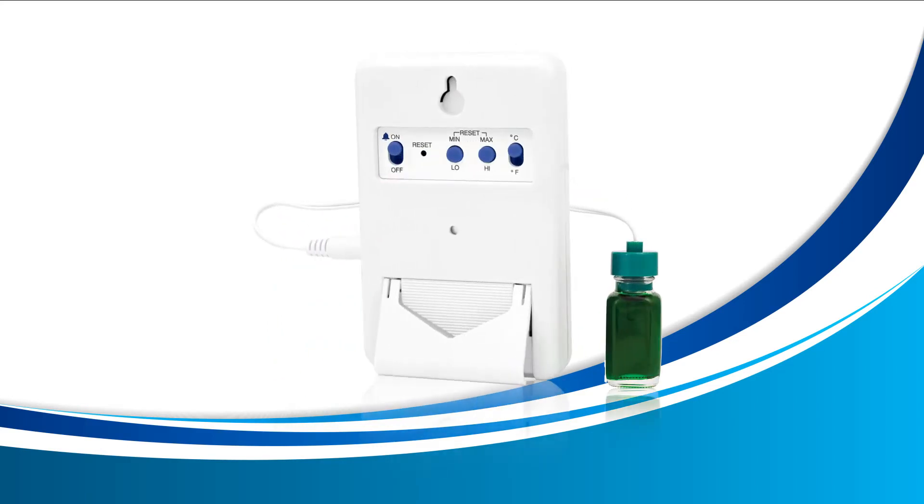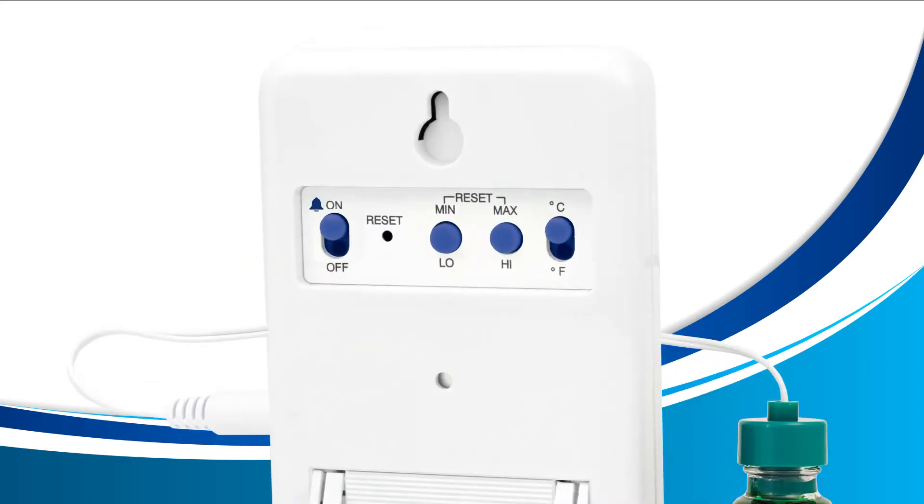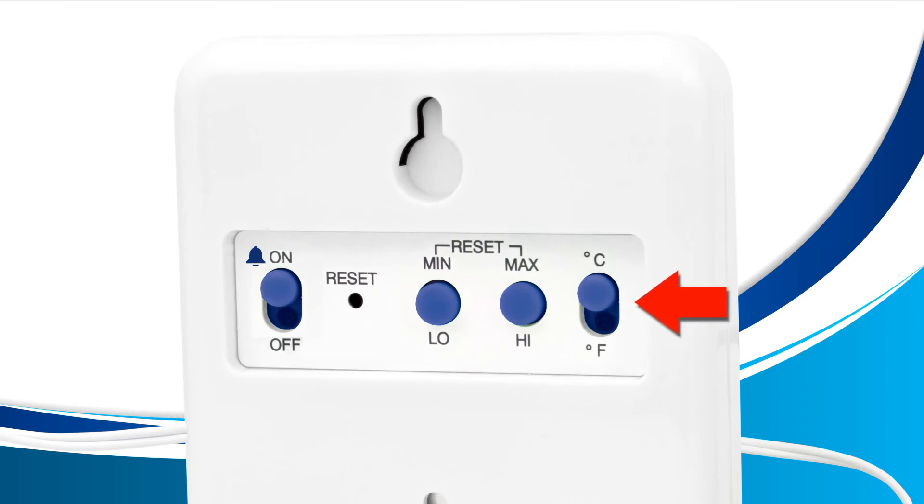First, take your thermometer and turn it around so that you're viewing the back. Towards the top right, you'll see a switch that has the letter C at the top and F at the bottom. Use this switch to choose the way you prefer to read your temperature.